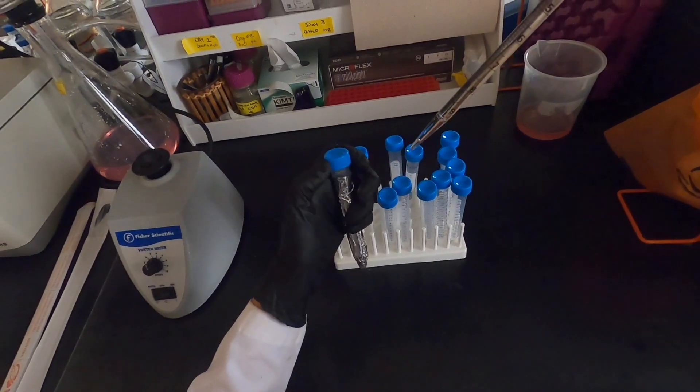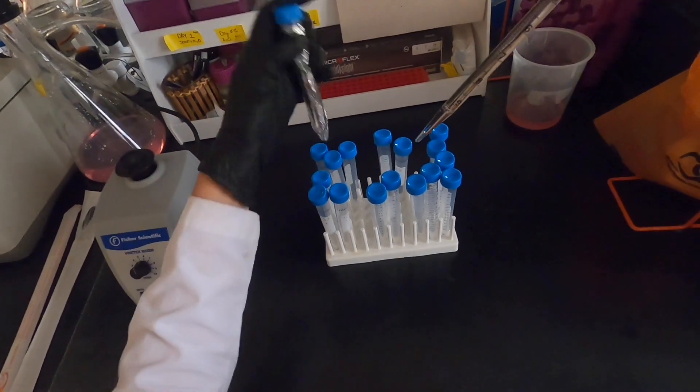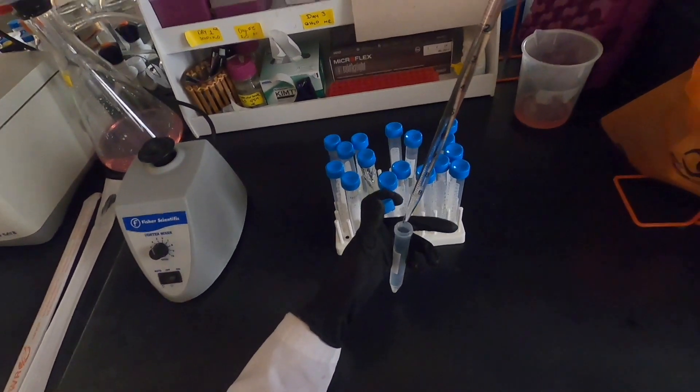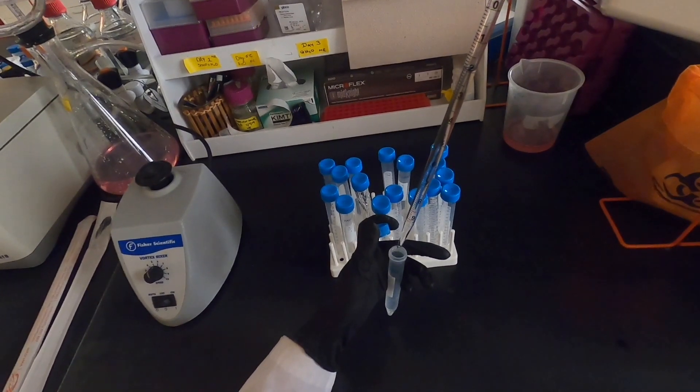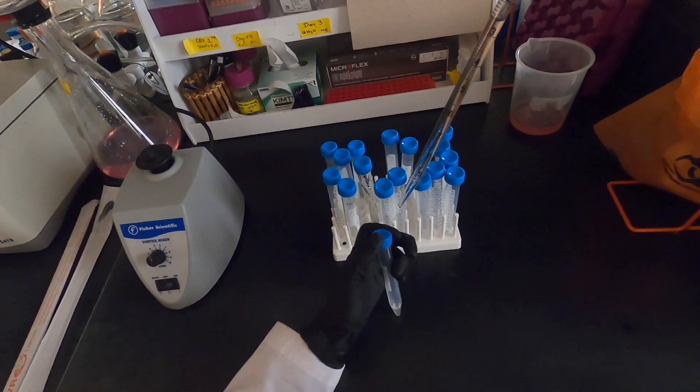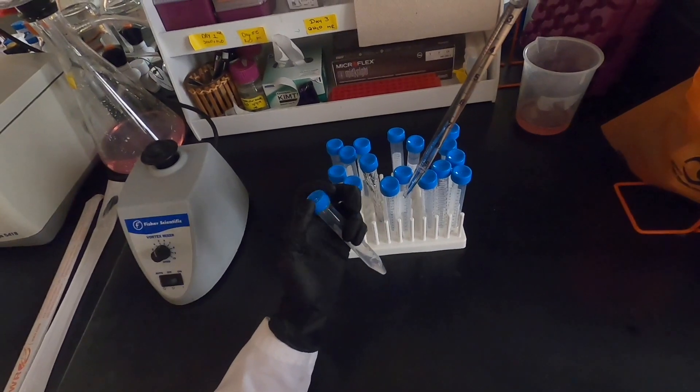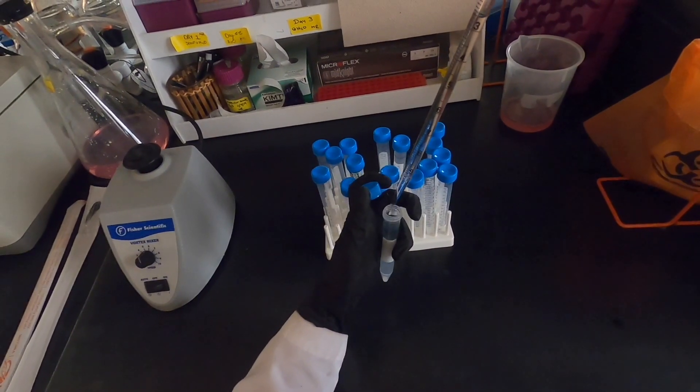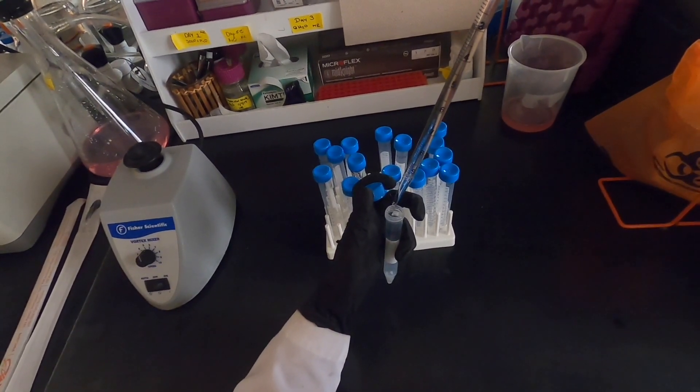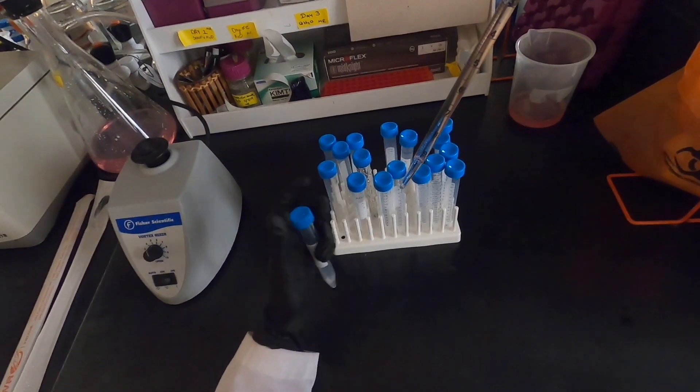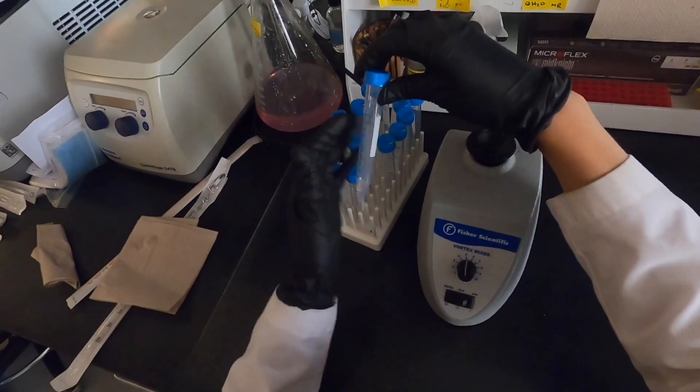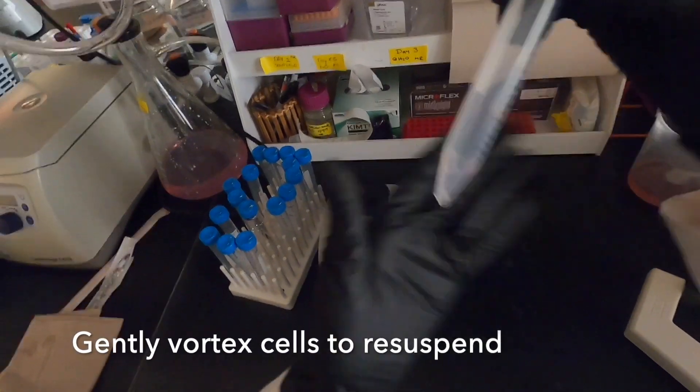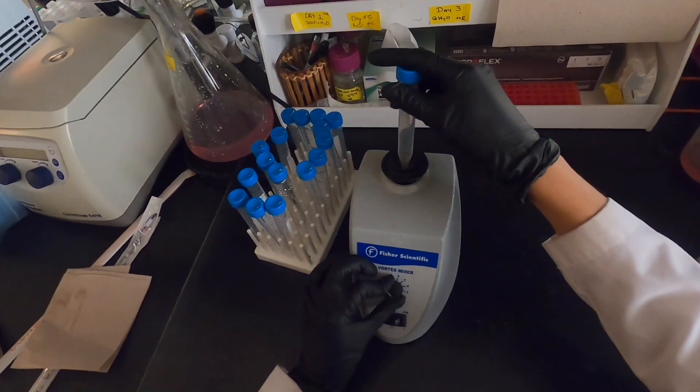Because PI can bind both DNA and RNA, we use RNase in order to degrade RNA that is present in the sample. This will leave mostly DNA for PI to bind to. We will now resuspend our pellets by gently vortexing. You can also resuspend the pellet by pipetting up and down.